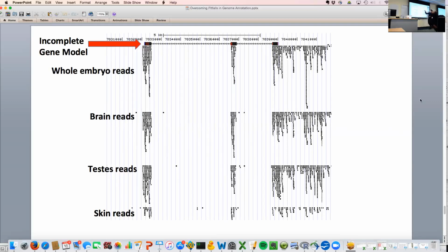So this is where, a lot of the time, you're going to get all your reads, and if you have incomplete gene models, they're not going to be counted. This is why it's really critical for your genes of interest to look at the transcriptome data like this, and then Moni's going to show you how you extend the model so that you can capture all of your expression data. Most studies just throw that stuff away.